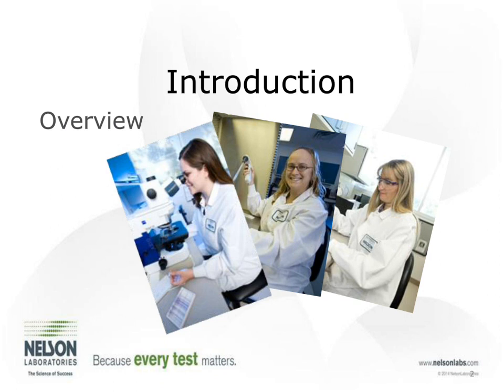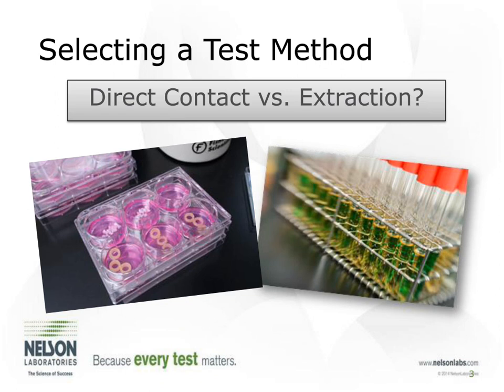So when we're talking about the big three, the first thing we always have to talk about is the difference between a direct contact test and an extraction test. So the big three has these different versions where the test sample can either be applied directly to the test system, where we take the sample that we're intending to test and we'll either apply it to the cells directly or we'll apply it to the skin of the animal directly if we're doing an animal test.